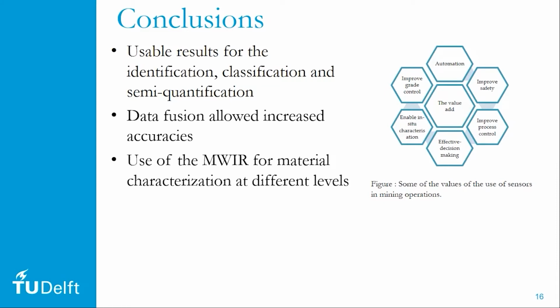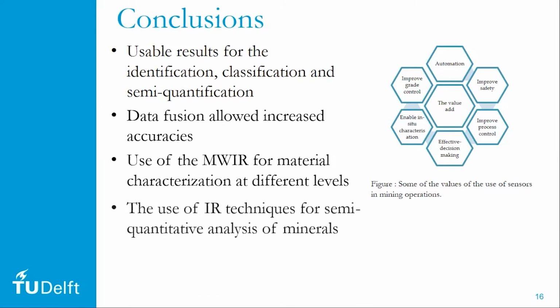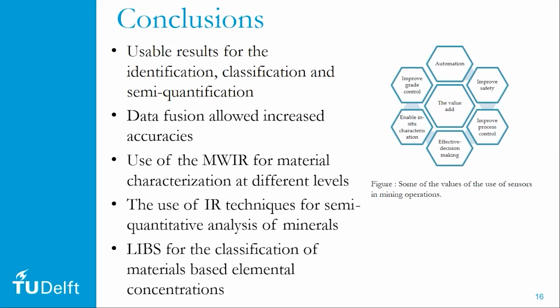This is interesting since mid-wave infrared is the least explored region of the electromagnetic spectrum and the least explored region of the infrared due to limited historical sensor development. But the results in this research suggest great potential of the technique in material characterization. The experimental results also show that LIBS spectra can be linked to the elemental concentration, and the result is promising for semi-quantification using optimal methodological approaches.